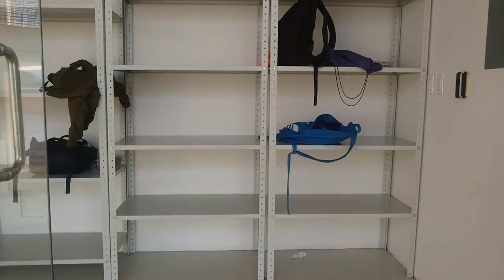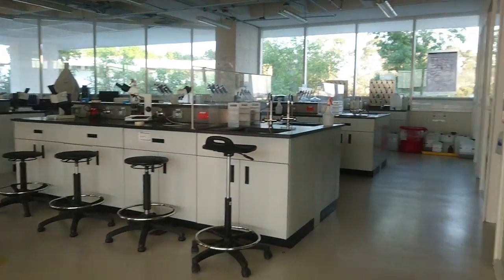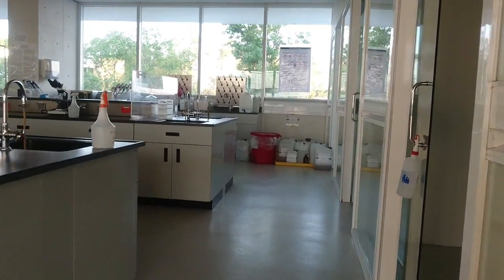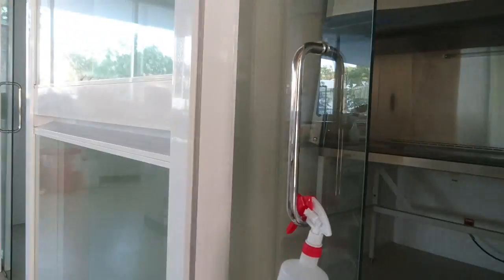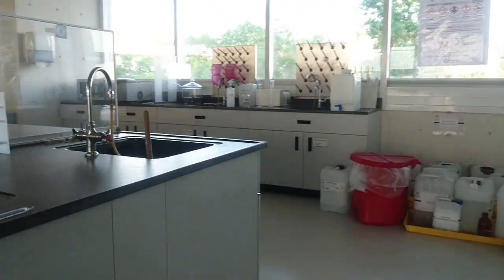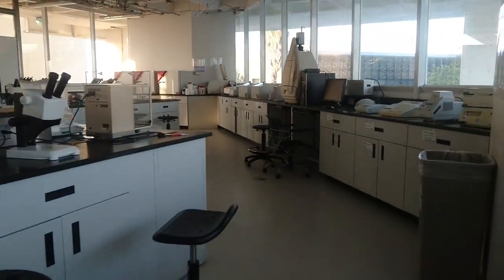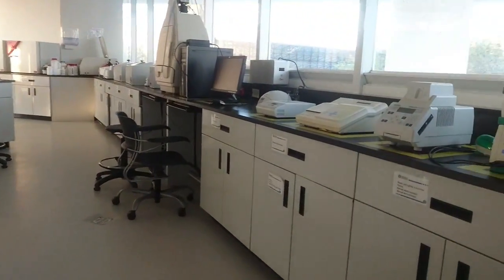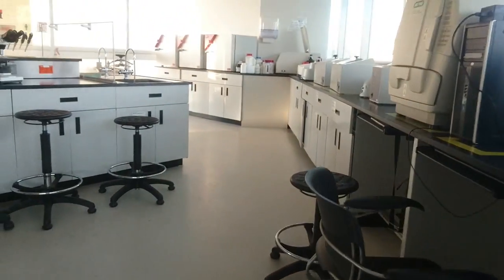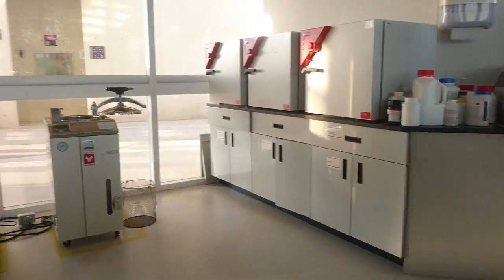Knowing the lab equipment and materials and the way they are organized is fundamental for the realization of experimental work, as by knowing the equipment, functionality, and applications, the number of errors committed is reduced and yields results closer to the expected ones. One of those materials is micropipettes. Micropipettes allow us to measure and transfer precise volumes in microliters. There exist manual and digital volume control micropipettes, and they may use a single tip, so they are called monochannel, or multiple tips, or multichannel, which allows for the transfer of multiple equal volumes in a short amount of time.